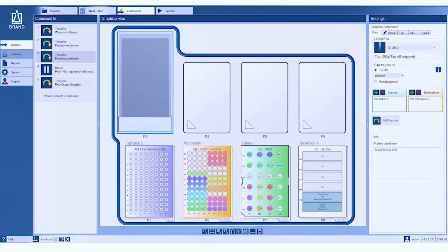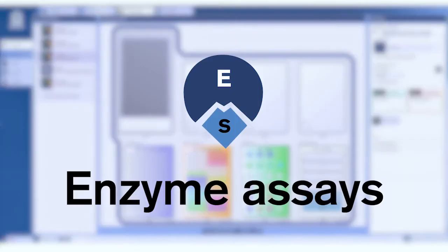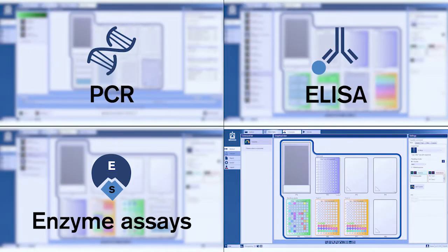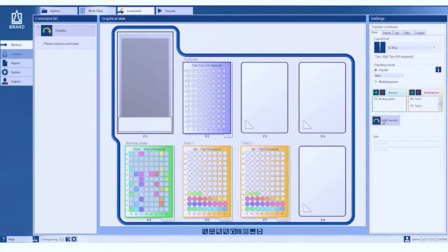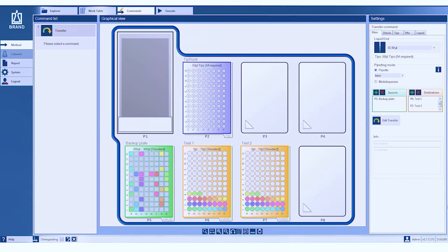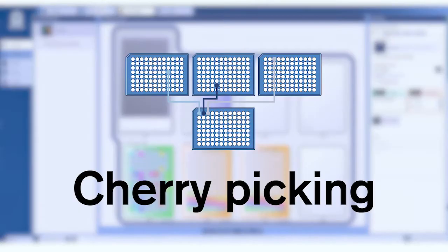Enzyme assays, quick and precise pipetting, mixing and setting the incubation times. Cherry picking, picking of the relevant wells, perfect for the liquid handling station.